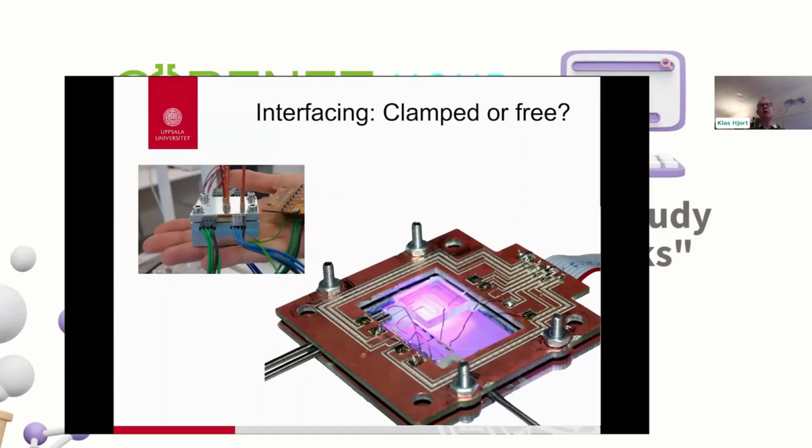And when we did the stainless steel stuff, we always worked with clamped systems to reach high pressure capacity. With the strong bonding and the miniaturized devices that you have in silicon or glass microfluidics, you do not need to have a clamped system. Also, if you go up to 700 bars or so, it's all a question about the sizes and the thickness of the material. And we often work above 100 bars and around 200 bars for our systems.